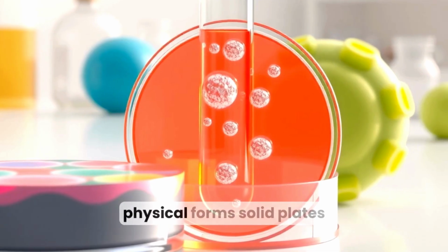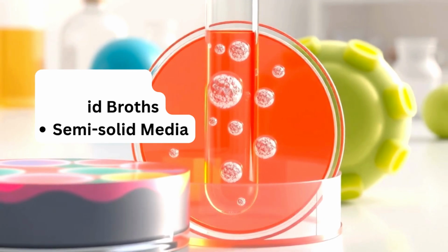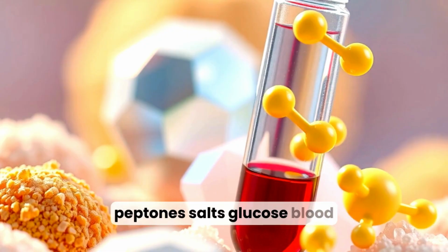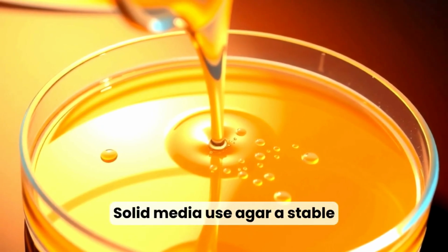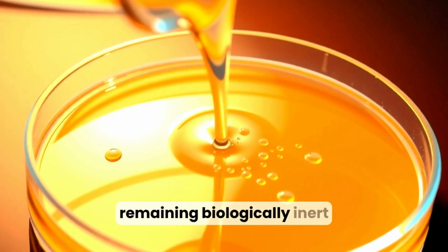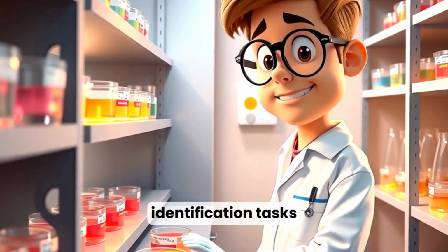Media come in different physical forms: solid plates, liquid broths, and semi-solid media for motility testing. Common components include peptones, salts, glucose, blood, or serum when enriched growth is needed. Solid media use agar, a stable gelatin-like agent that solidifies the plate while remaining biologically inert. Understanding these basics helps you choose the right medium for isolation and identification tasks.